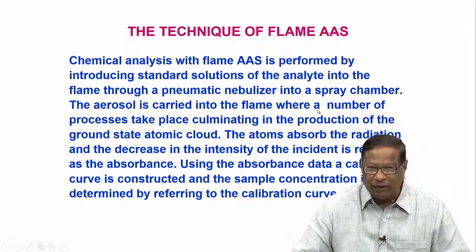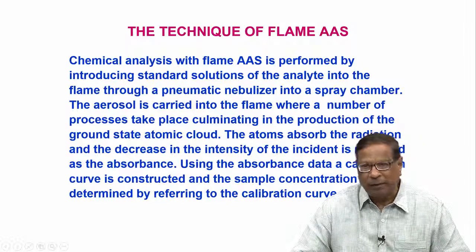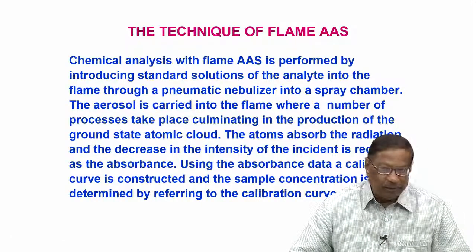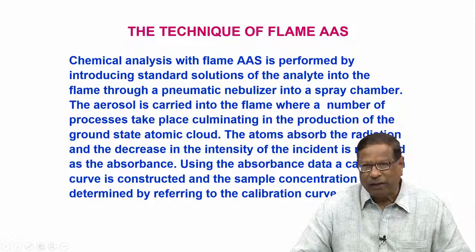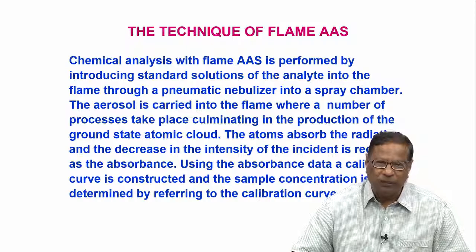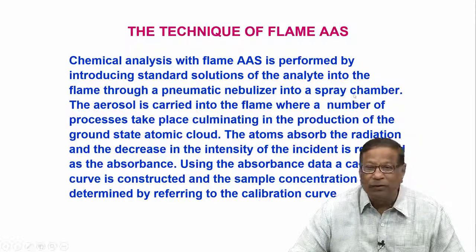This is the general principle of all spectrometric techniques, including spectrophotometry, infrared, atomic absorption, flame emission, whatever it is. You have to prepare the standards and refer to the standard curve, corresponding to concentration versus response, for your sample. So, flame atomic absorption is no exception.